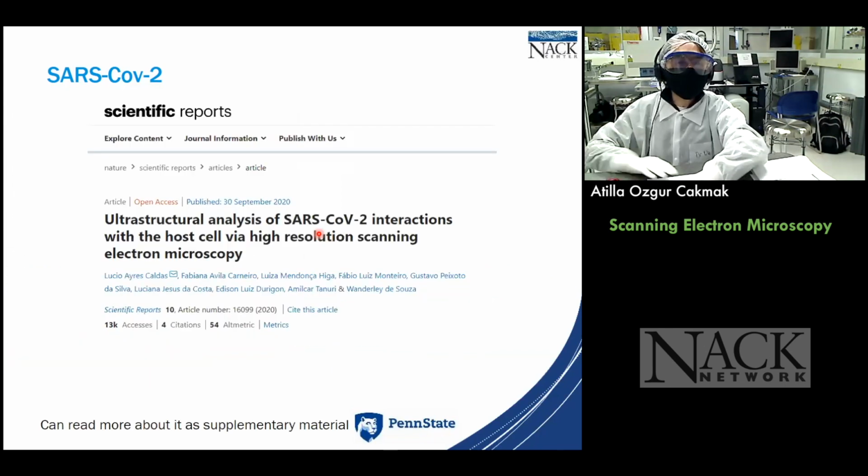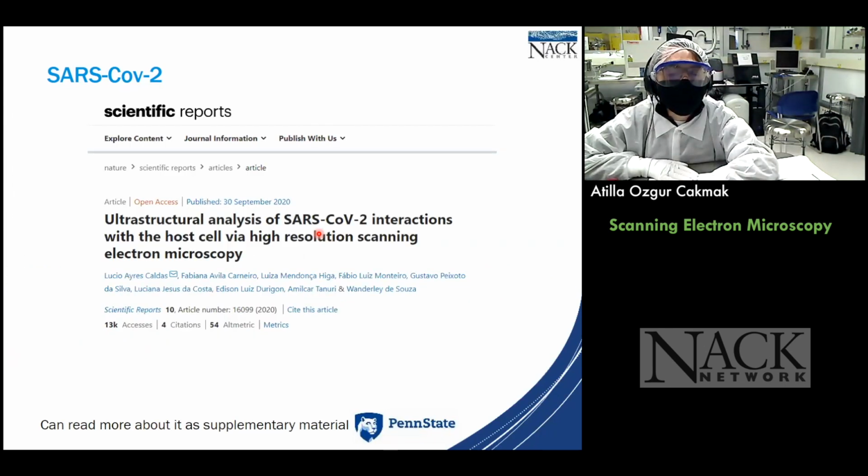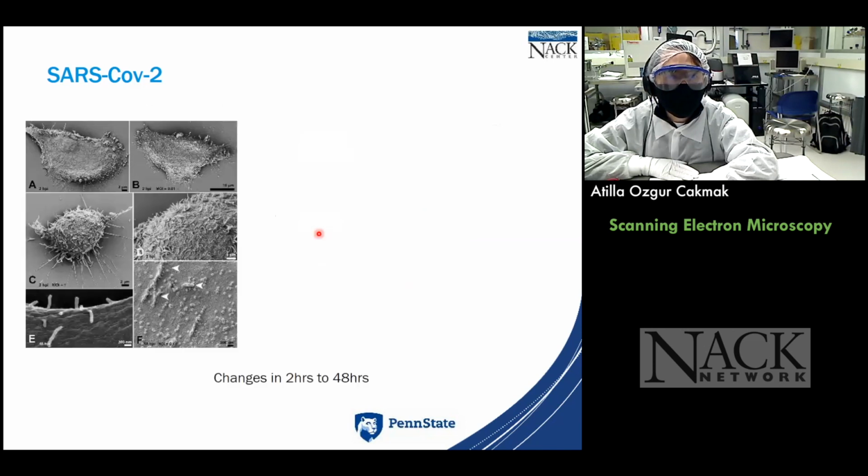All right, I'm wrapping up now, so you can get more contemporary examples of how electron microscope is being used in COVID-19 research, like this other supplementary material that Rene uploaded. In this paper from 2020, they investigated how the cells are infested with these coronaviruses.